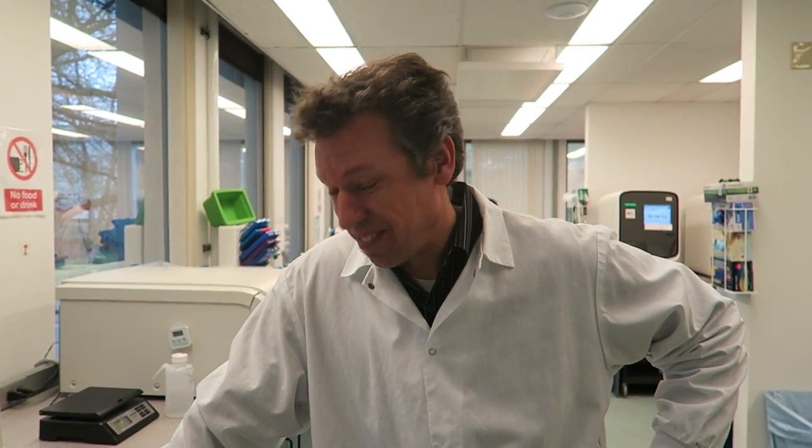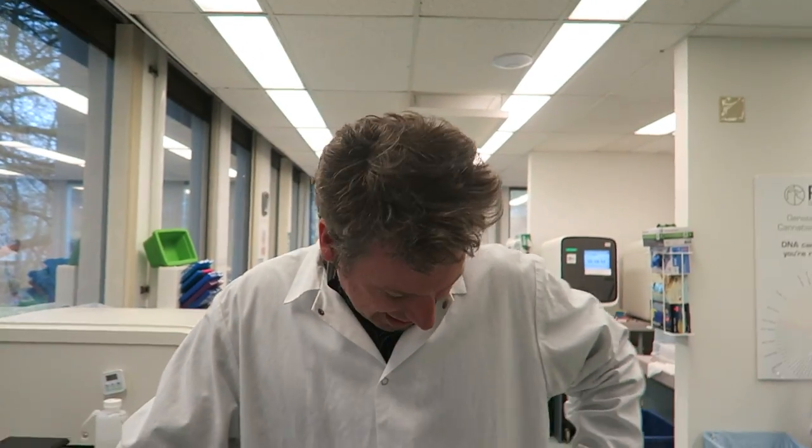Hey Nishan, how are you doing? I want to say thanks for the white coat because you've got to keep everything clean in here.